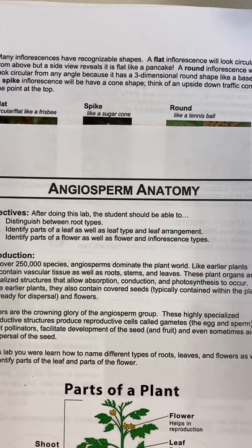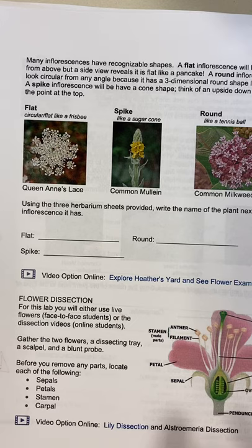Hello, the purpose of this video is to walk you guys through the steps of a flower dissection. You should have your angiosperm anatomy lab packet nearby. The part we're going to be doing is near the end where it says flower dissection and it has a label illustration.